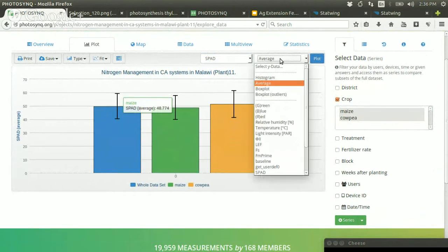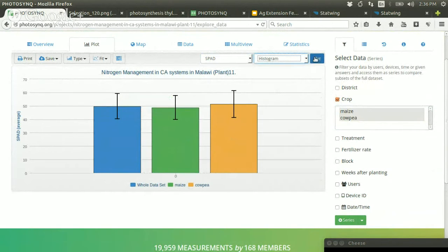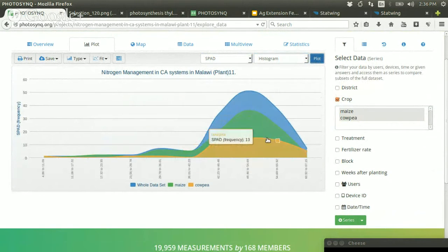Now the trick with this stuff is that there's actually a lot of variation, right? And you'll find this. In these fields, there's a huge amount of variation. So to try to pull out anything specific is quite difficult. And so for you guys, you're going to want to use a little bit of statistics to be able to say something interesting from what is otherwise fairly messy data. So I want to show you an example project that we've done that on.